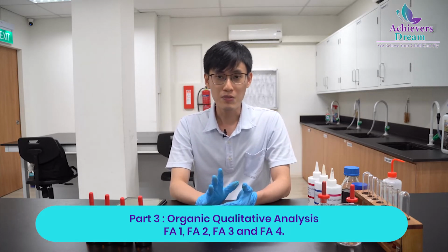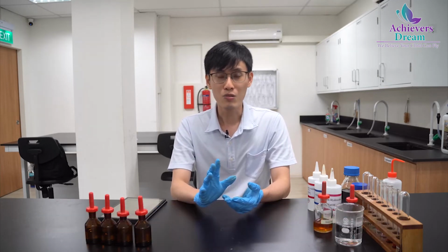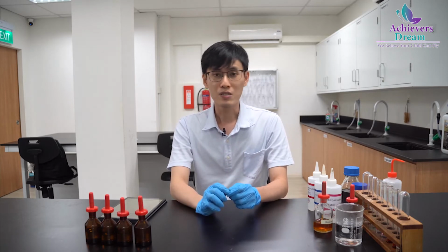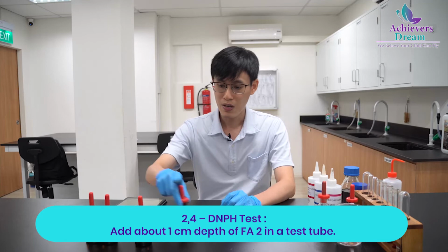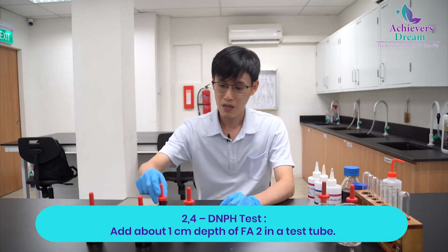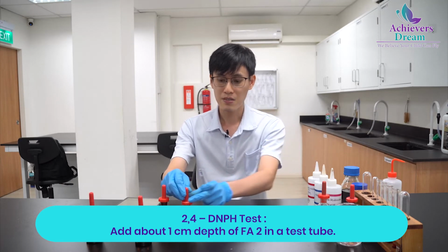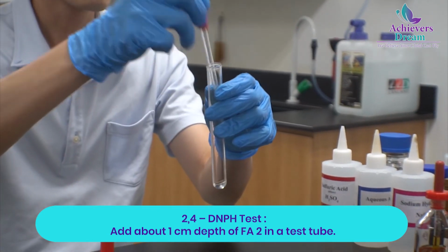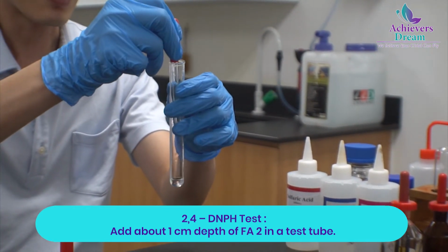We will be doing a series of tests. Some of them have already been done, so all we need to do is to complete the remainder. The first test we'll be doing is the 2,4-DNPH test. We'll be doing that on FA2 and FA3. The 2,4-DNPH test confirms the presence of a carbonyl group. We will expect to see a precipitate, usually bright orange in color, if there is a carbonyl group.